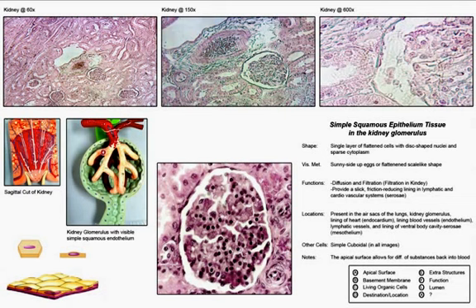This is a good picture that we're looking at of the glomerulus. So this is one of these magnified at full magnification, and we would be looking at the simple squamous cells in a chain all the way around the Bowman's capsule, and that capsule is seen here with its squamous cells as the structure that would receive filtrate as it's filtered through the capillary bed or the glomerulus itself and the endothelial lining that's seen here under hydrostatic pressure. This is that glomerulus that we were just pointing to.